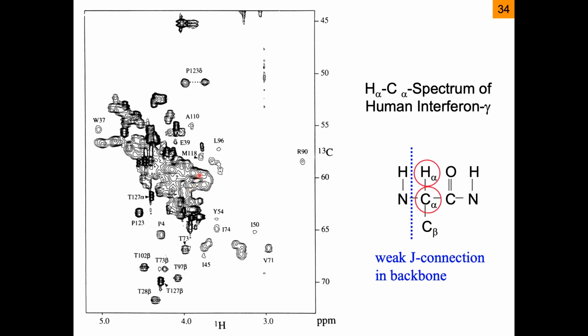And you would like to go further if you had an HNCA-CO. At that time, we didn't have it for deuterated proteins. You could go to the CO, you would have an additional nucleus to connect with, but the efficiency gets less and less.